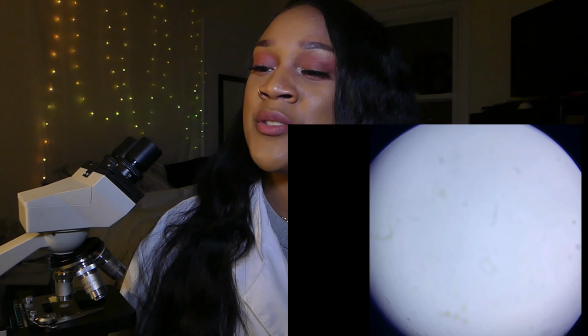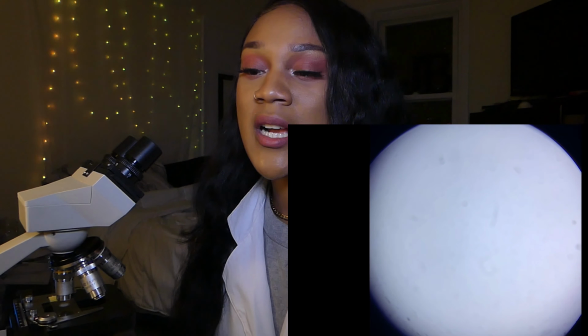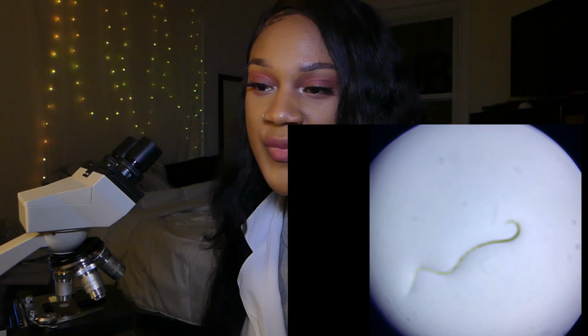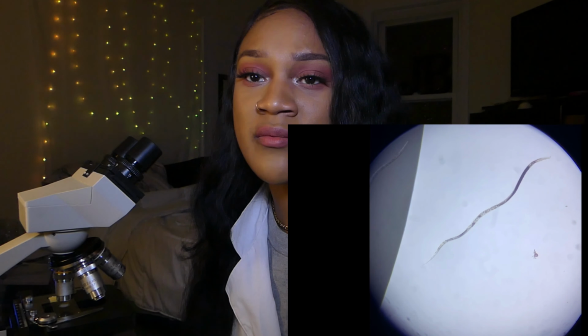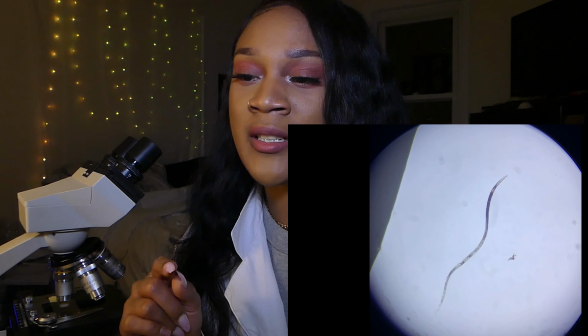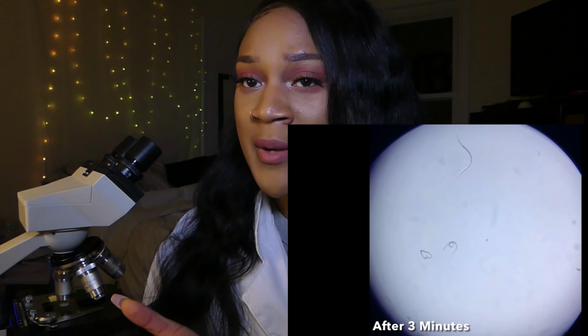So alcohol trial 2, just to see if we can have a consistent result. I just added the droplet. What's this? Oh, this micro eel or vinegar worm was on the outside of the culture droplet, and I just wanted to see if it was even touched by the alcohol.